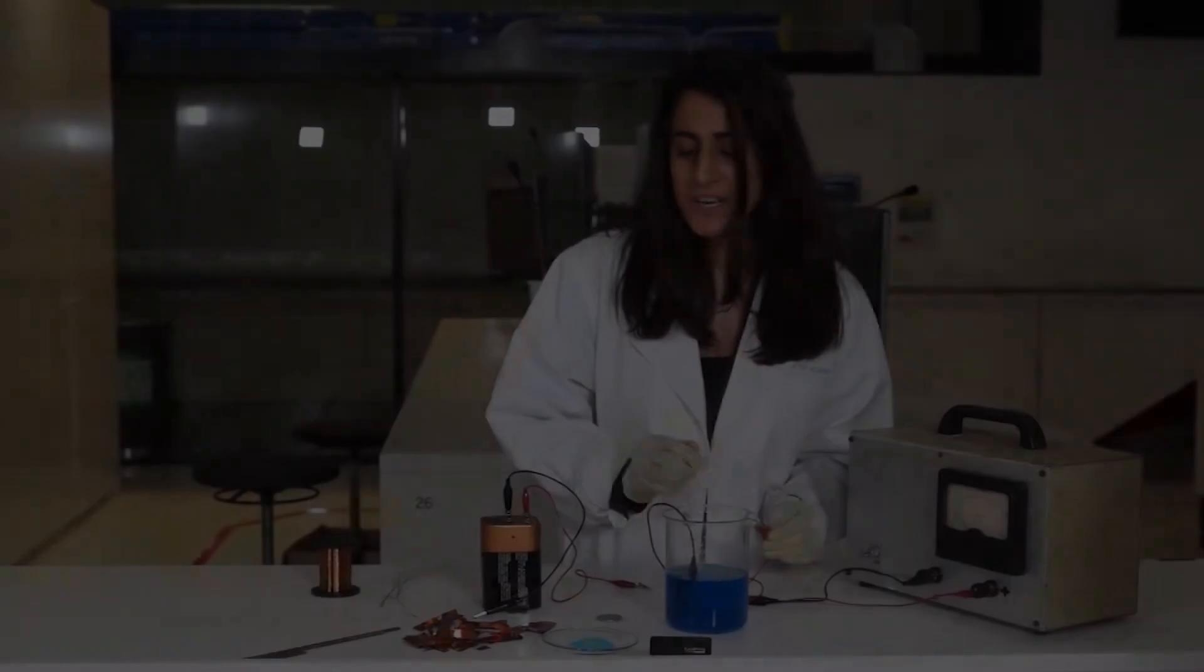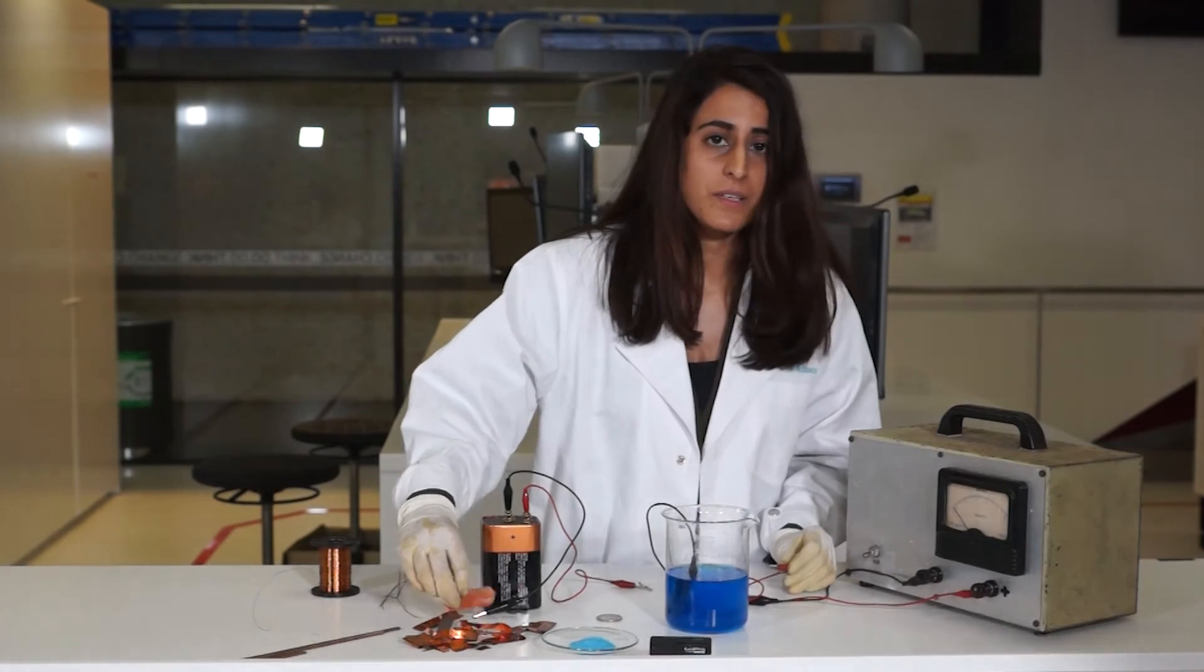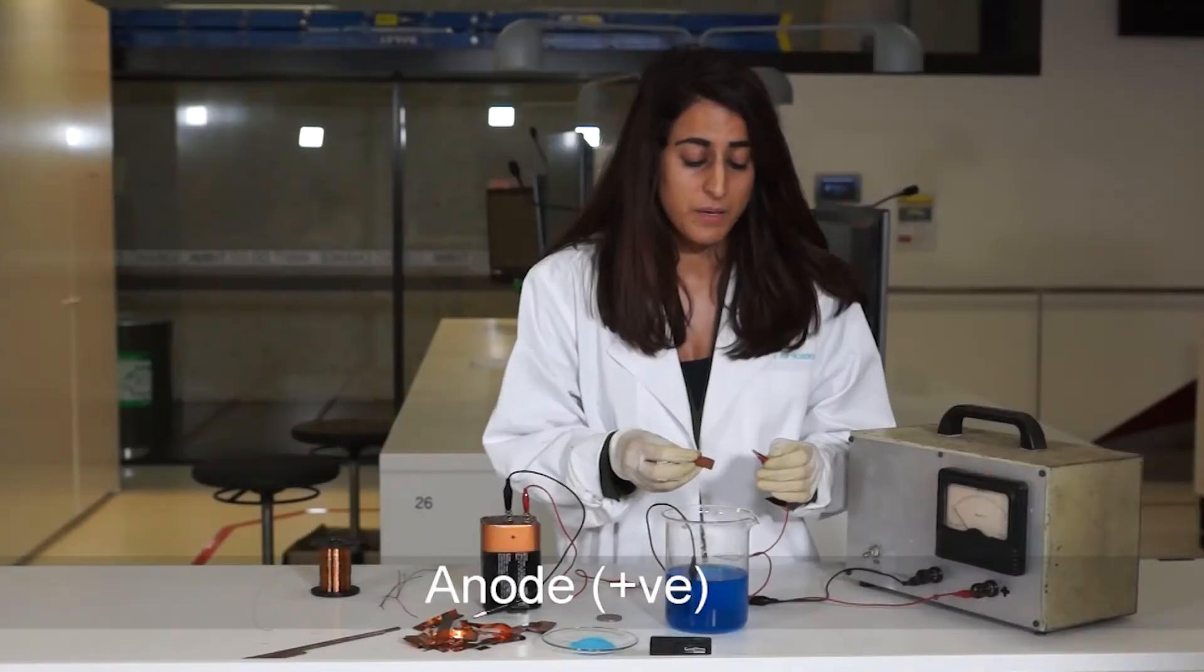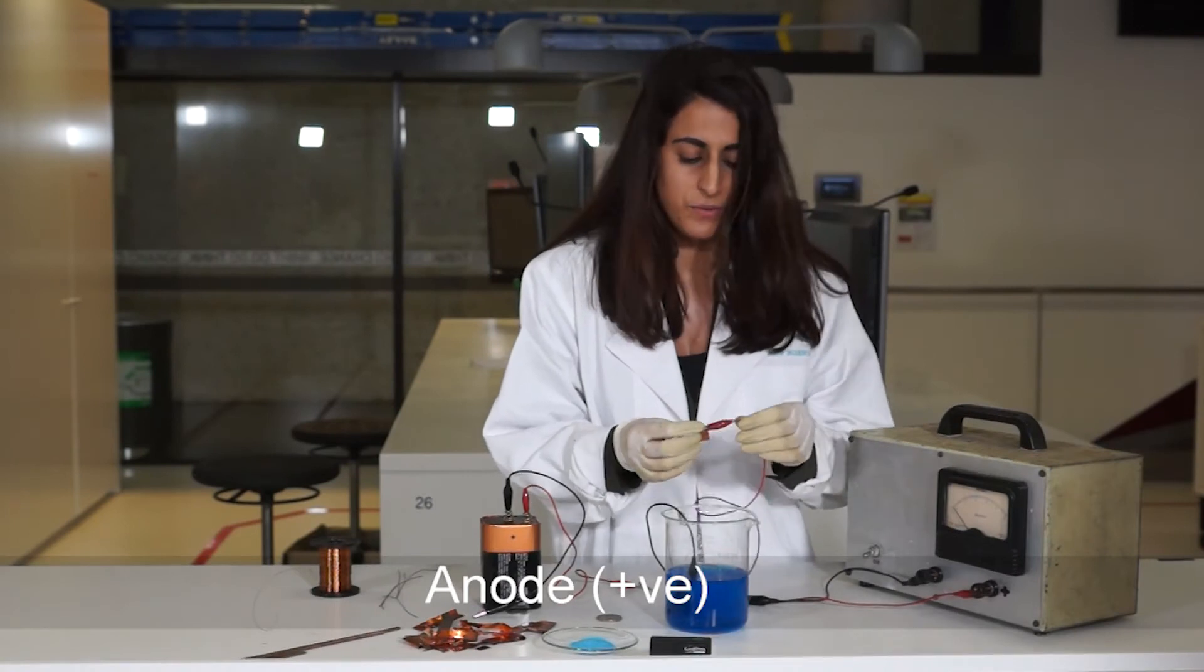Now we need another electrode to complete the circuit. And for that we're going to use this copper metal, and we're going to connect it to the positive terminal of this power source.